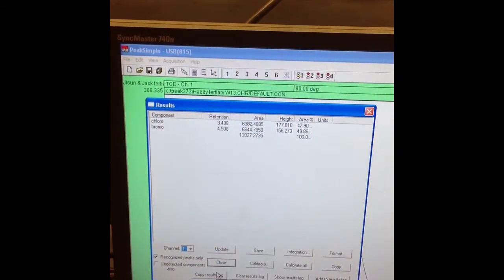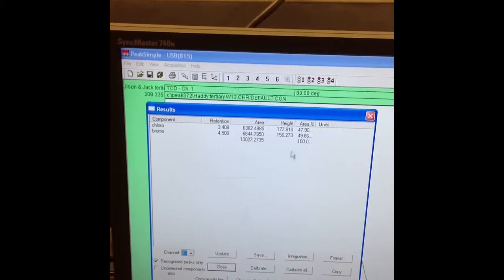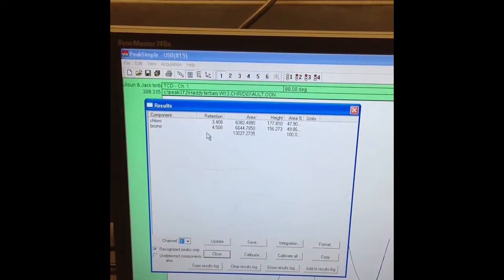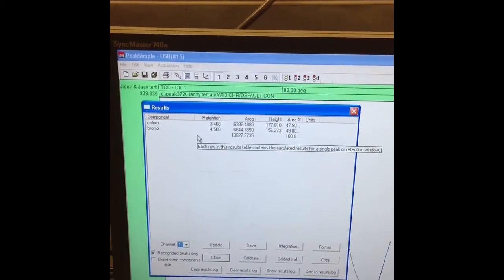Now I'm going to go to view and then click on results. And right here we have the area, the height, and the percent area. So as we can see right here, our retention time actually matches the standards.